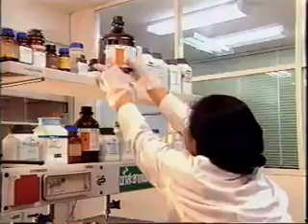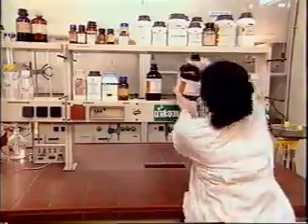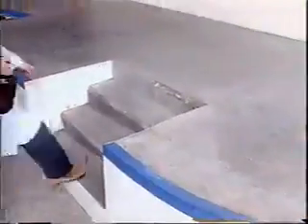Heavy bottles that have to be handled with both hands may not be stored over head height. Large bottles should be carried in a carrier. If no carrier is available, a plastic bucket may do the job.